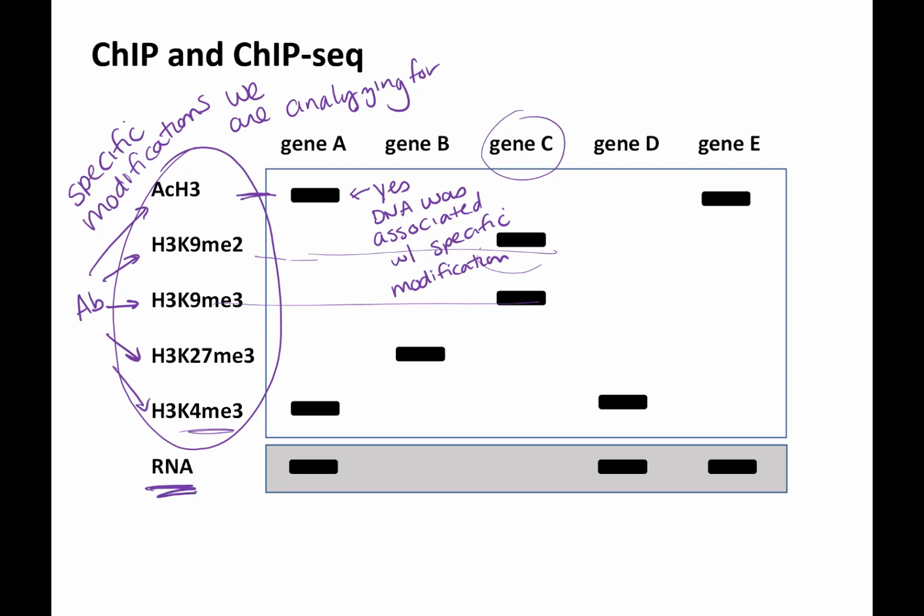The RNA comes from a totally different experiment. I know I didn't make that clear in class. For RNA, we do something called RT-PCR.